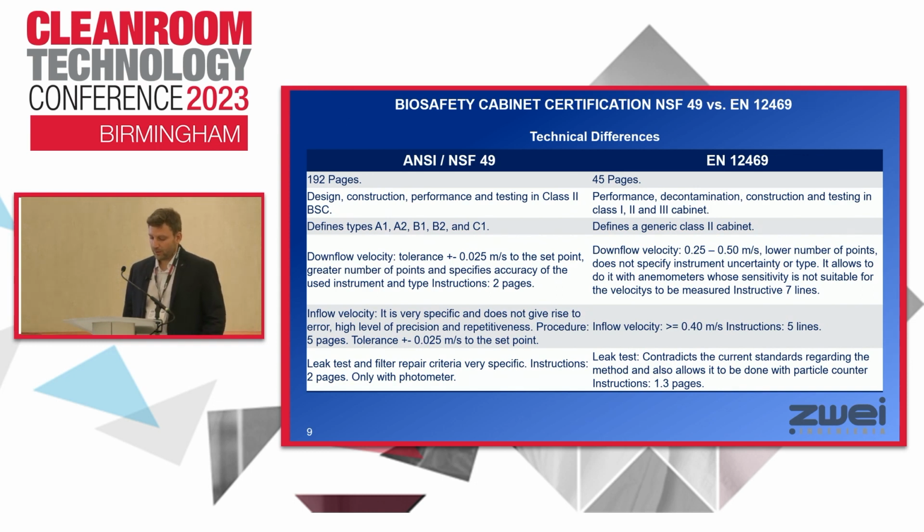Instead, the EN instruction contradicts the current standards regarding the method and allows it to be done with a particle counter, but this is not according to the method expressed in ISO 14644 part 3, or the technical guide for leak testing in HEPA filters, IEST 34.